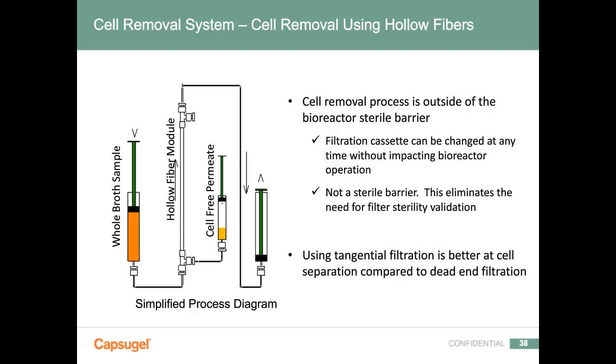Also, it's not a sterile barrier. So in any kind of clinical GMP type operation, a membrane that's inside or acting as a sterile barrier of your bioreactor has to go through sterility validation.